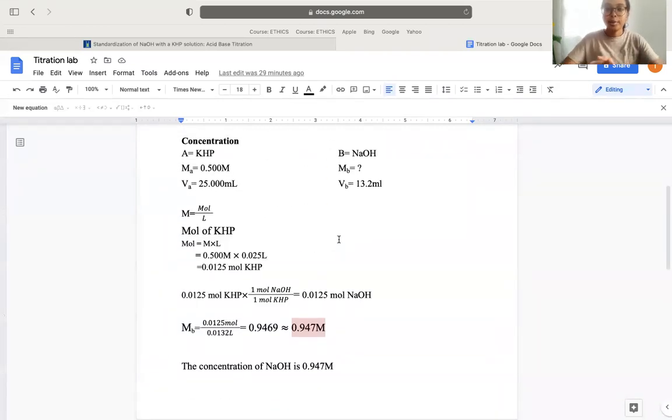So that concludes my experiment of the standardization of sodium hydroxide. Thank you.